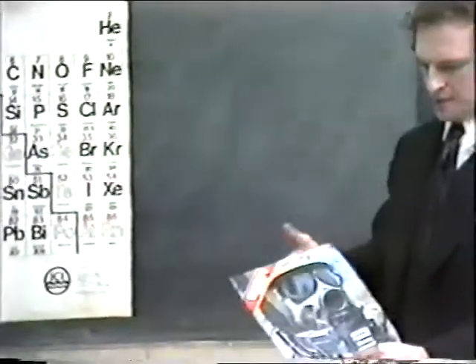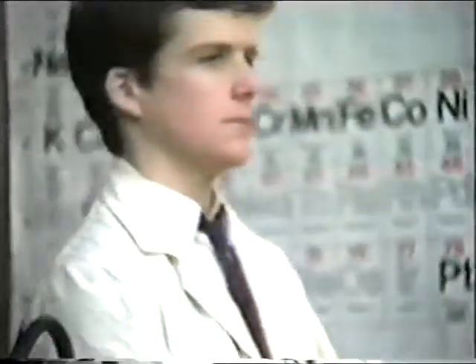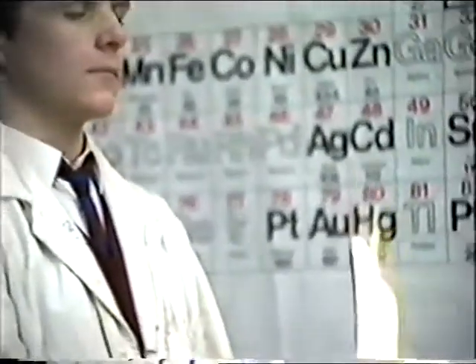And therefore, strictly speaking, this experiment should either be done in a fume cupboard, or, if you permit me to show you, we should be wearing this kind of protective clothing, as you see, full gas mask facilities. So the gas is extremely dangerous. We've prepared only 2 gas jars here. We have, as you see though, several other gas jars which will be used for further experiments.